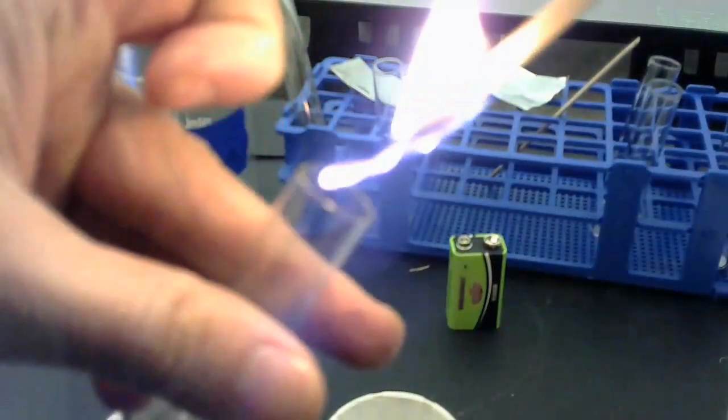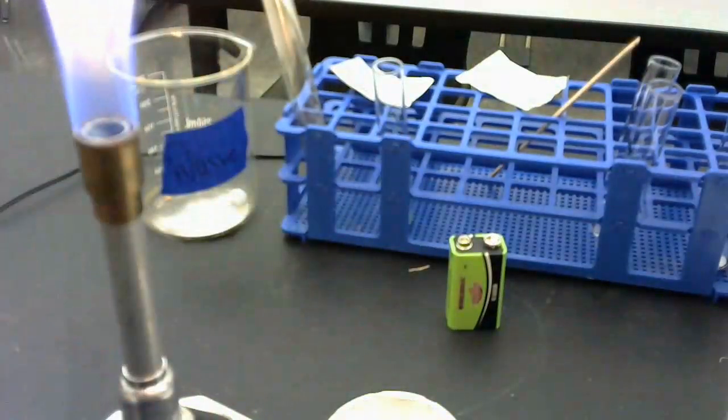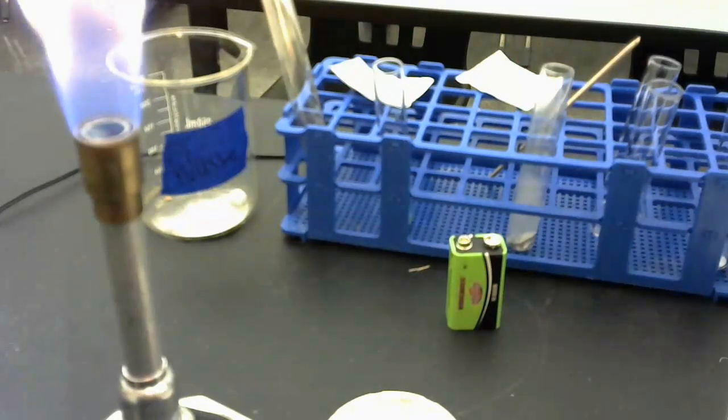Did you hear that pop? Okay, hopefully you heard that pop. If not, you can go ahead and rewind it. Hopefully you heard it when you were in class doing your reaction, but that was a pop.